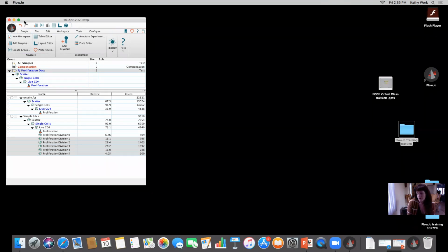I don't necessarily suggest those to our users. I've tried them. Typically what I ask for is a nice cell line control. We have users that come in to do sorting. They have their tissue that they are using to see a variety of different populations, but they have their cell cycle, and a cell line is a nice control for us to be able to see that we're in a linear range, that everything looks nice, and our peaks are nice and tight.